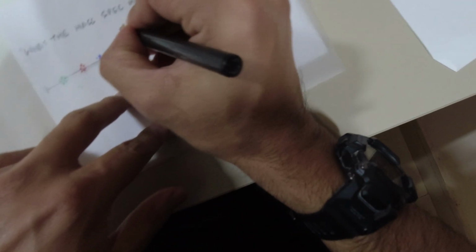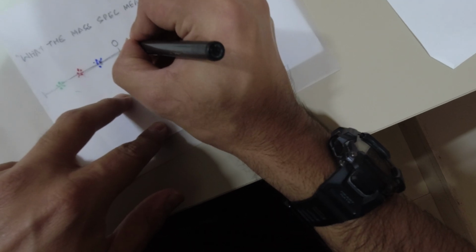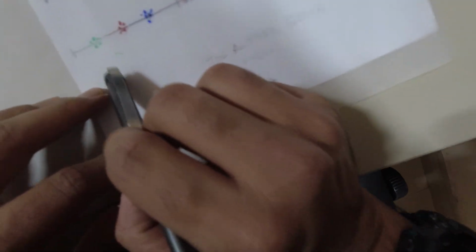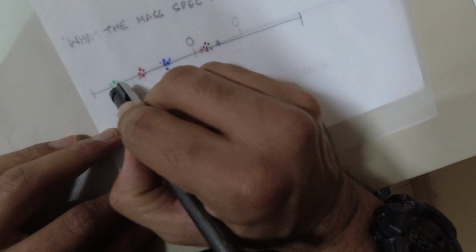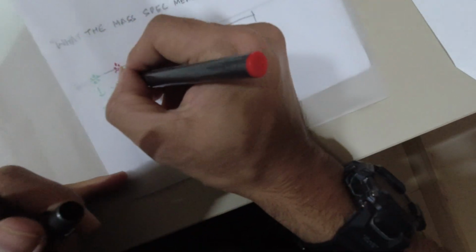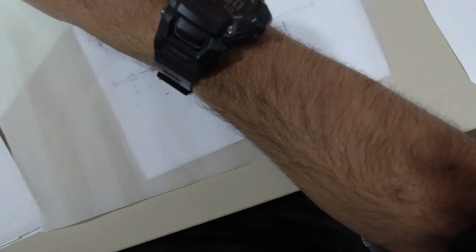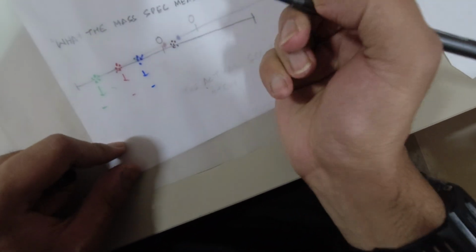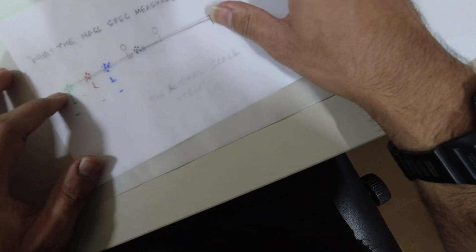And of course, we'll also have our own samples, right? So we'll just throw in, this is what's actually unknown to us. I'm just doing that in black color. And then the software is going to calculate an average of all these clusters and give you one value for all of this. It's like a mean value. And so that's my scale.